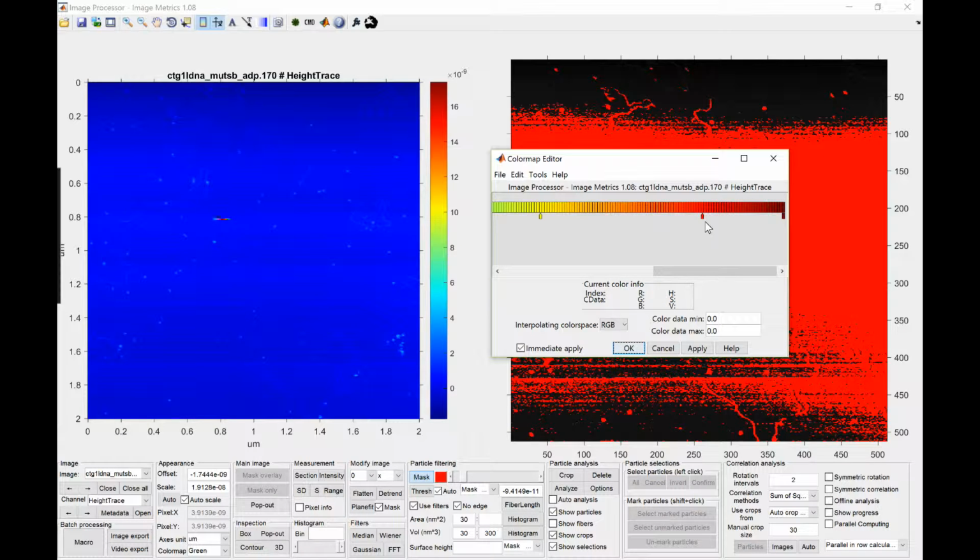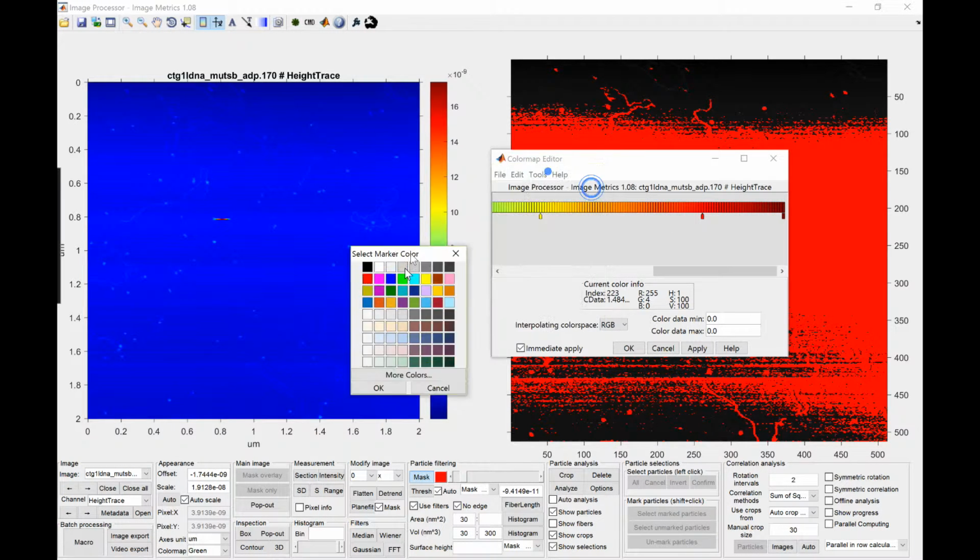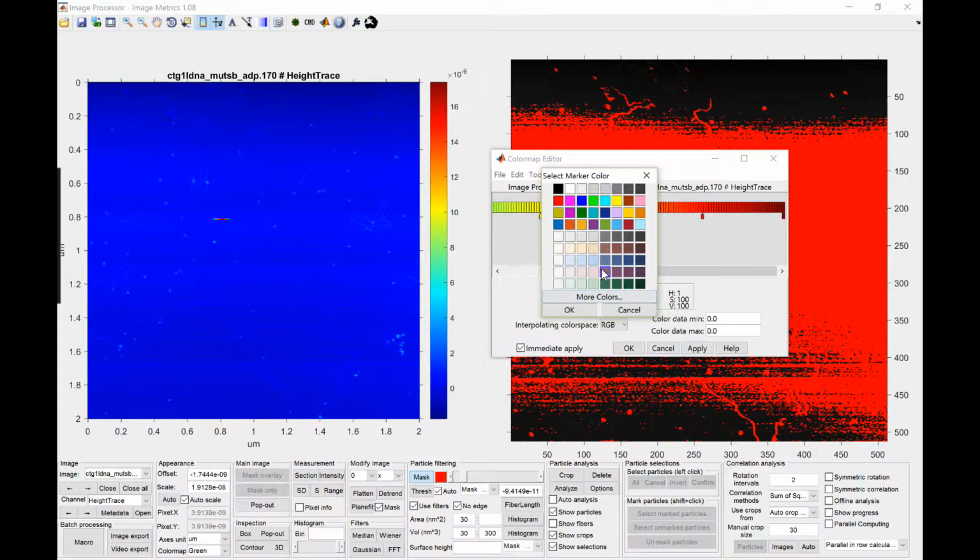these values. For example, if you click here, you just add additional colors, and, well, I think that's a lot. If you want to delete those, just click one of these arrows and click delete key. Right, just delete that. You can double click one of these, and then it pops up, and you can choose a specific color for that.